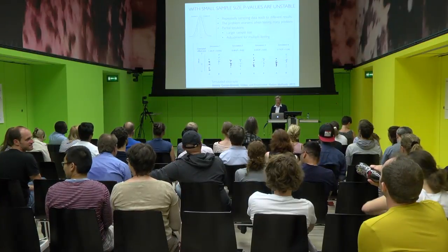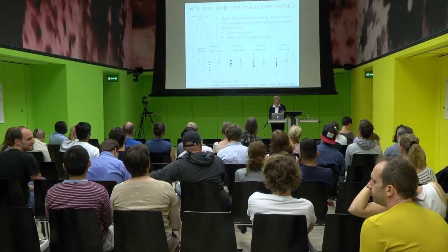Well, the answer is that it's an interplay between how big is the change, how much is the variability around the change, and how big is the sample size. If you have an experiment with a 20-fold change, you will probably see it with the naked eye, even with 1 or 2 replicates, and then you would repeat it and see it again. On the other hand, if you have a 1.1-fold change, most likely it will be underpowered, and depending on how lucky you are, it can go either way. So it's really a combination of the variation, the actual effect, and the sample size. There is really an interdependence between those three things.